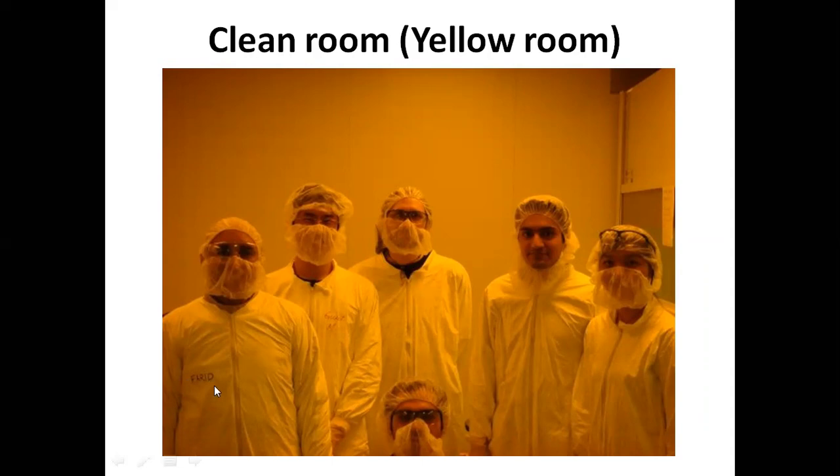You have to write your name here, so you cannot recognize people from the face. You have to write your name, or either you have to put the badge. So this is me. I have completely covered my ears and eyes with goggles, mask, etc. And we are inside the yellow room.